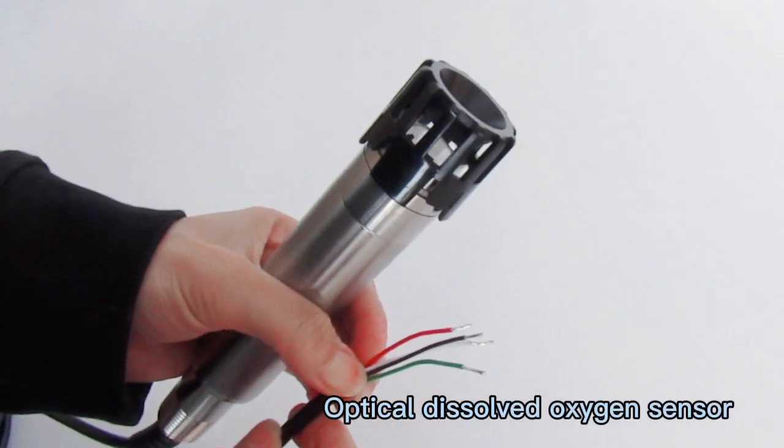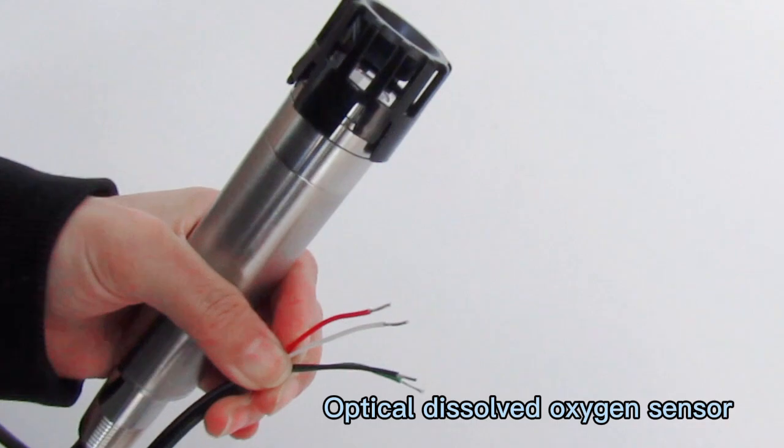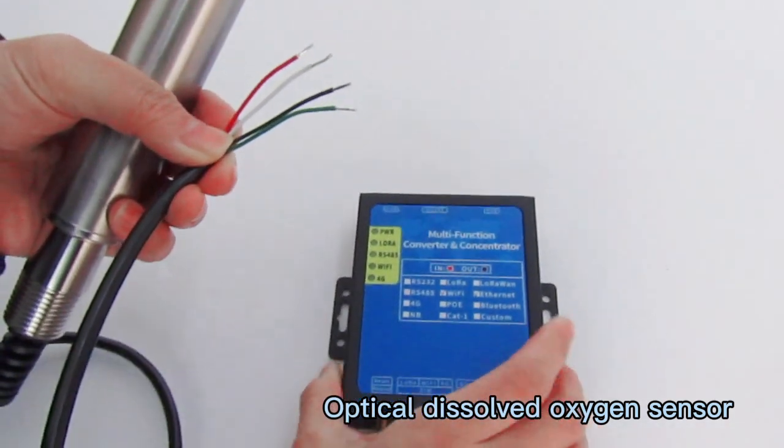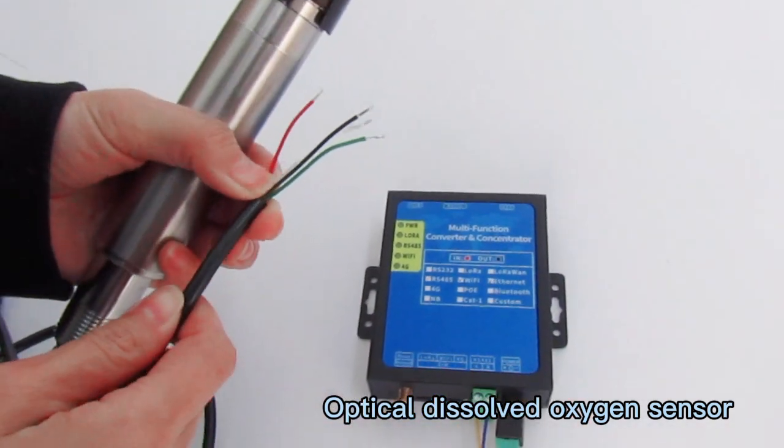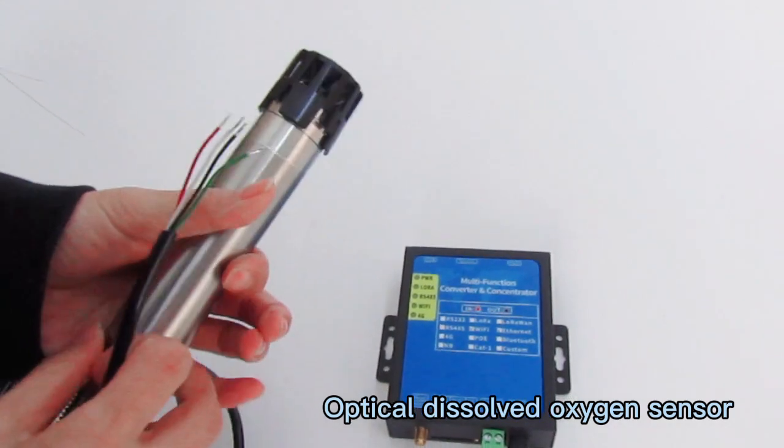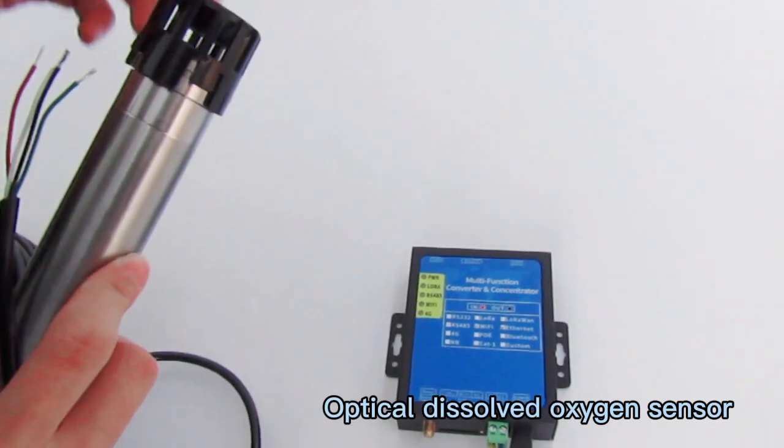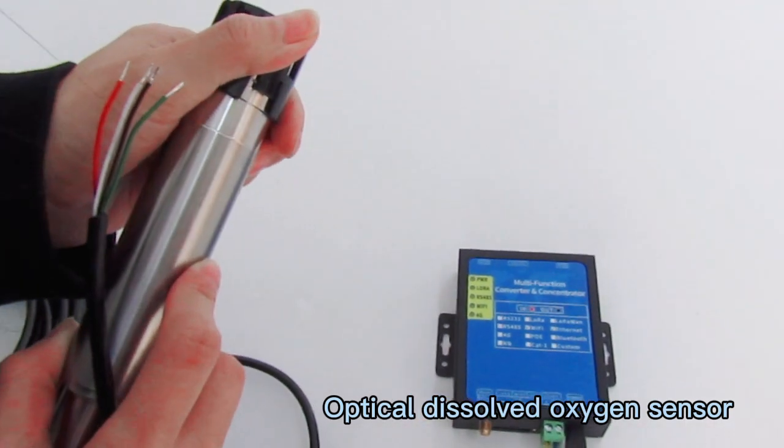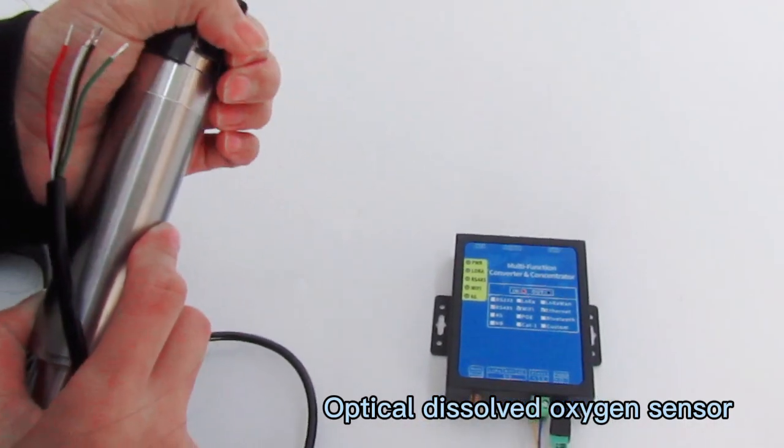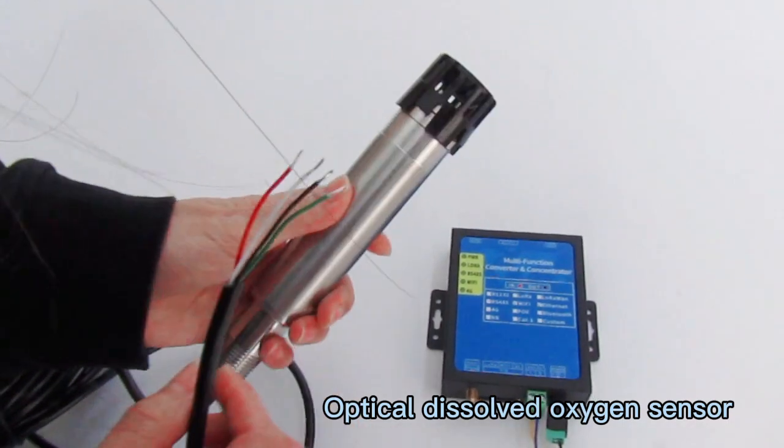The output is RS485, and we can integrate a wireless module to achieve wireless transmission. You can check real-time data on your PC using our wireless module, including 4G, Wi-Fi, LoRa, and LoRaWAN.